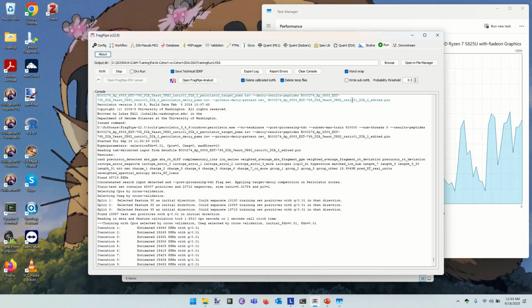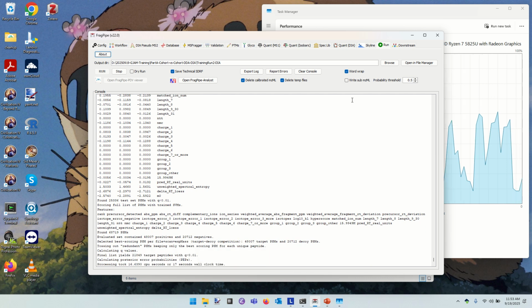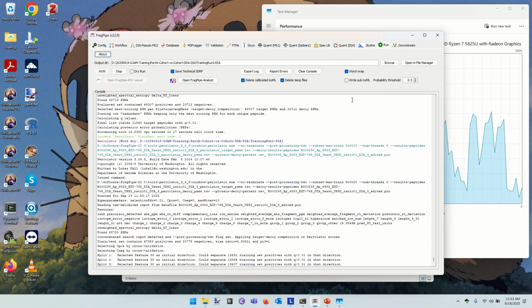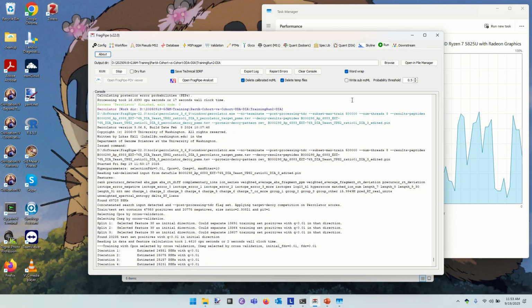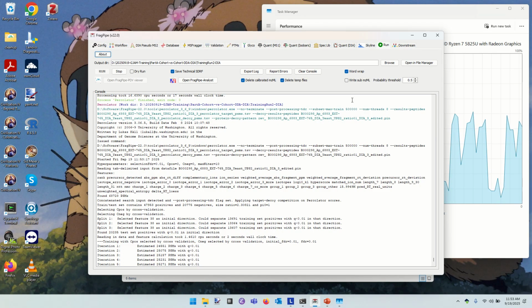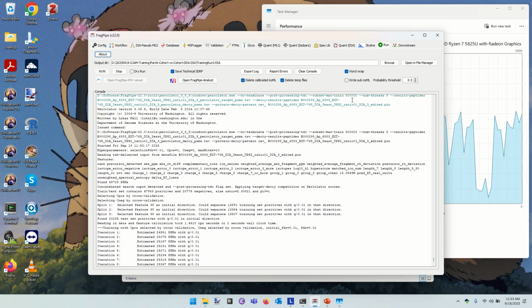When we had a particular peptide we'd identified, the quantity value that we used for it was all drawn from MS1 scans to say this peptide ion had this intensity, then it had this intensity, then this one, then this one.